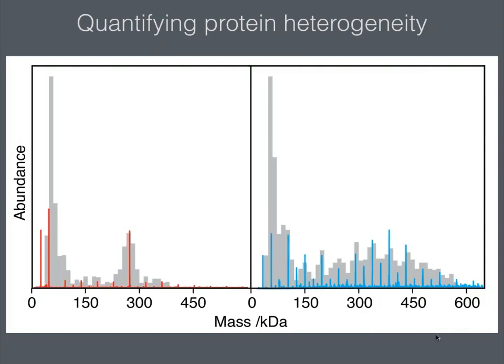This is a huge boon because the native mass spectrometry experiment by its very nature is a gas phase, vacuum-based experiment, which is not an easy experiment to do, whereas the mass photometry experiment is a matter of one or two minutes, and crucially is all done in solution. So these are mutually validating experiments in my view.